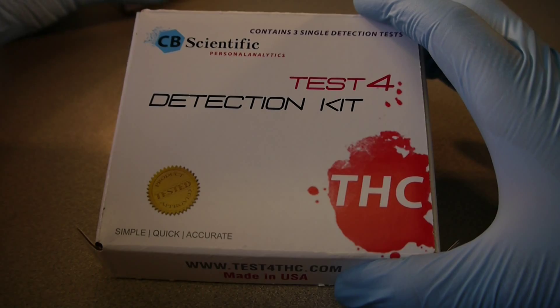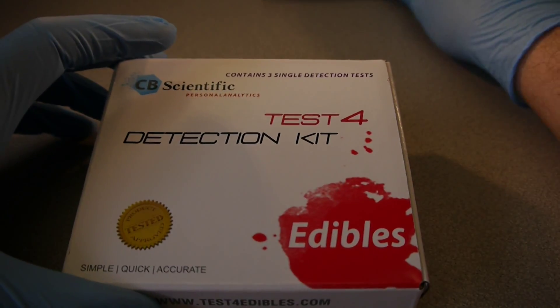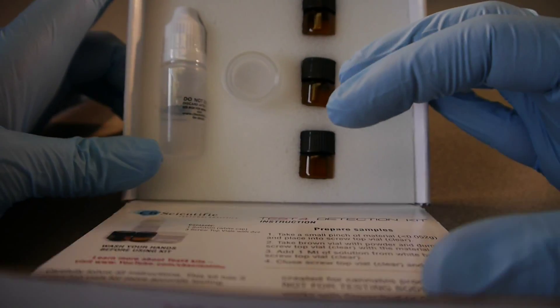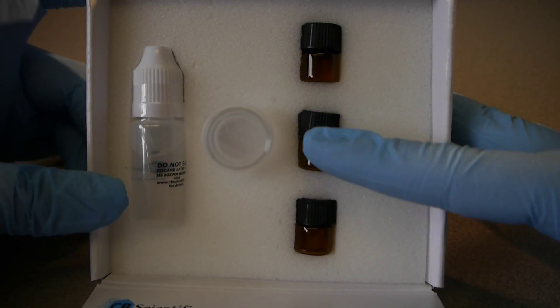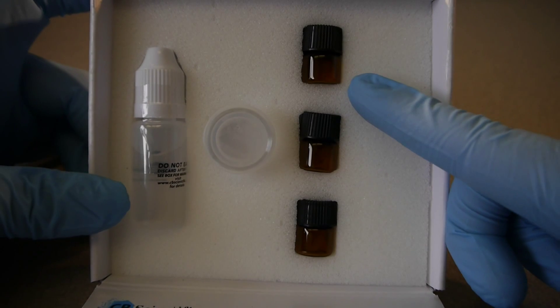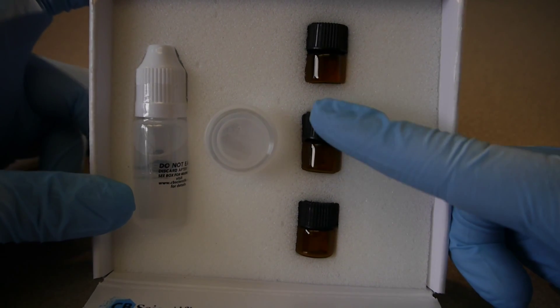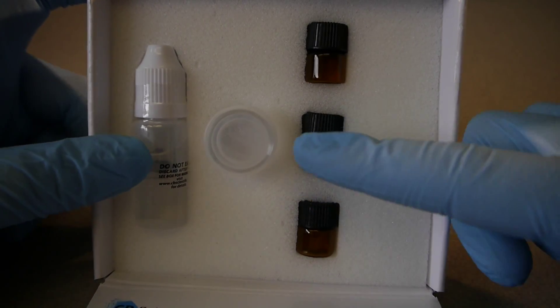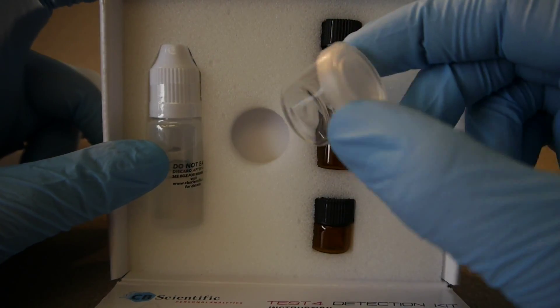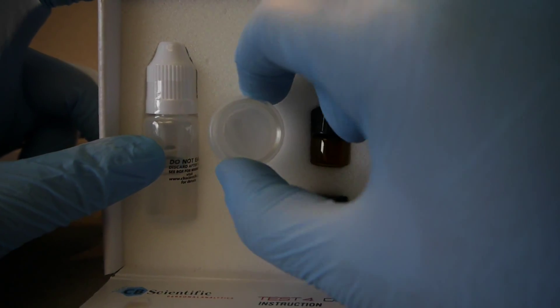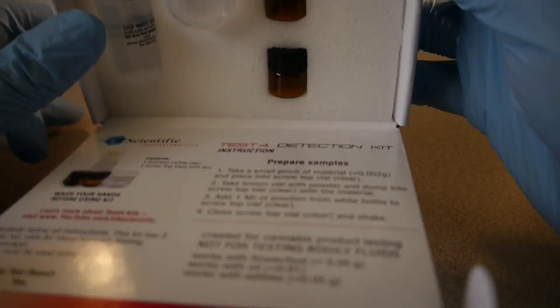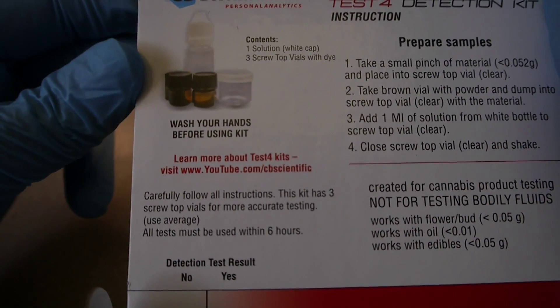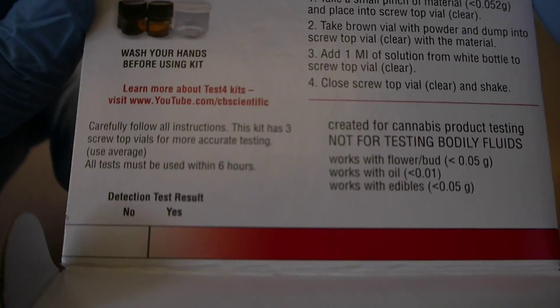Now we will get into the edibles detection kit. The reason why we're doing this is because they're very similar. Let's open this guy up right here. They are very similar. As you can see, we have the same vials here. There's a little bit different concentration of the dye solution inside. So they are different chemically, but they are the same detection for the THC molecule. And we also have our reaction vial here. This is a small glass reaction vial and, of course, the same solvent. Very similar instructions here. You guys can pause this and read this at your own leisure. Very simple. And of course, the gradient scale at the bottom.